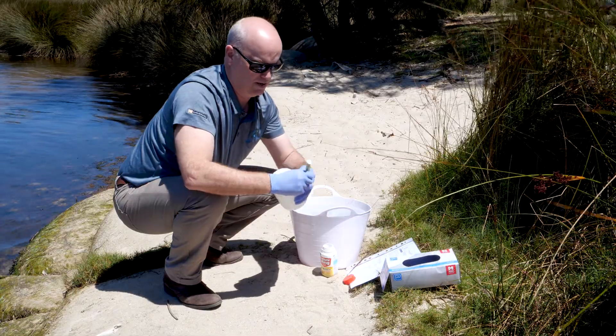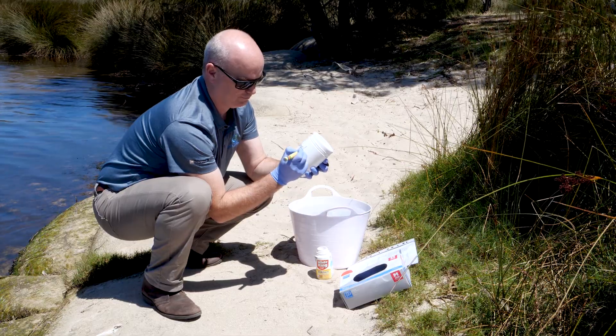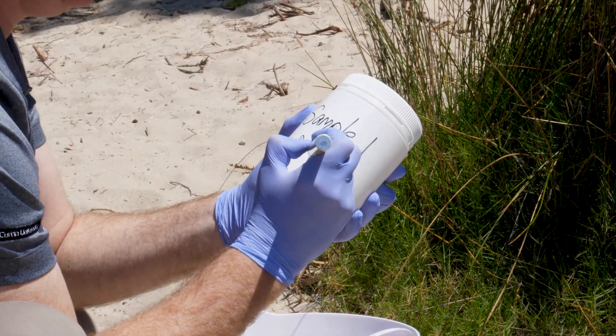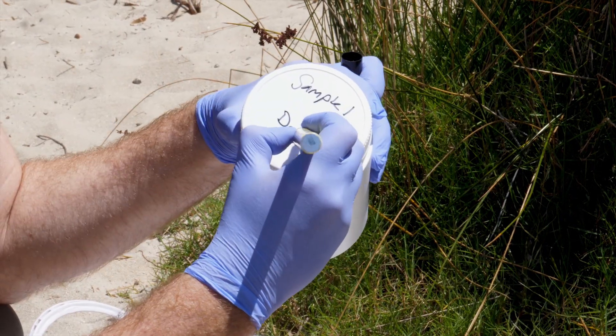Next, take the sample containers and label them with an informative site name, replicate number, and date of collection. To avoid contamination and confusion, labels should be on the side of the container and on the lid.